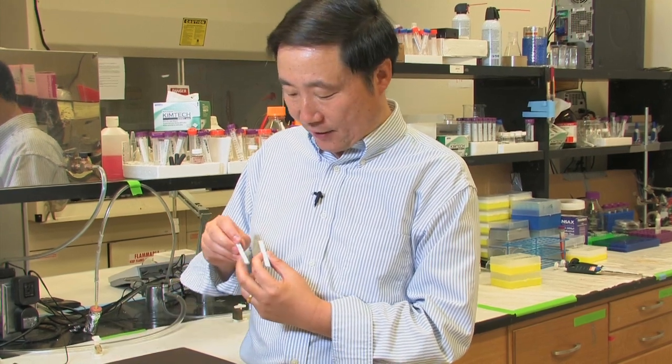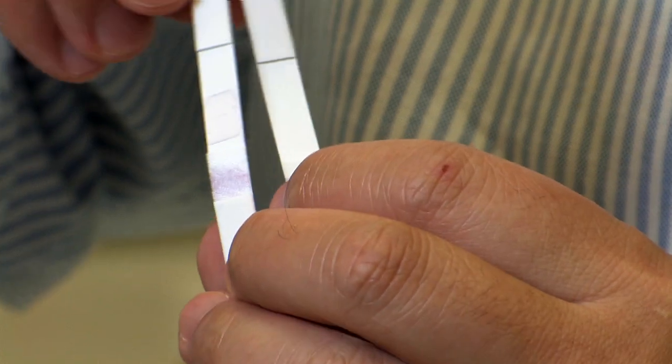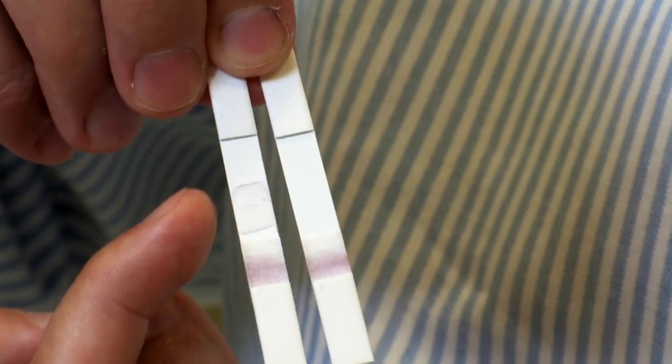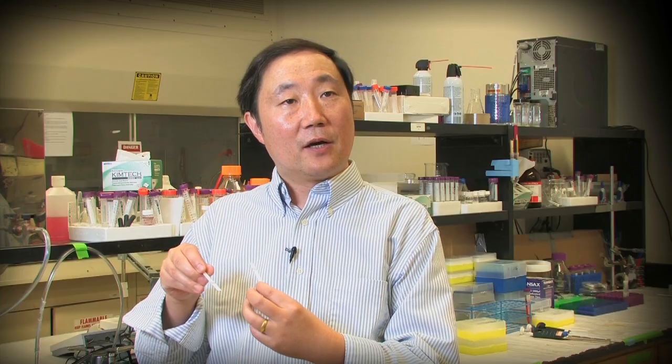Once something like this occurs, there will be color changes. And based on whether the color changes, where it migrates to, in a few minutes one can have semi-quantitative or qualitative information whether the food is safe to eat, the water safe to drink, or whether one has a disease in the urine or blood.